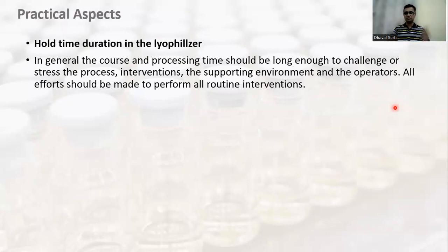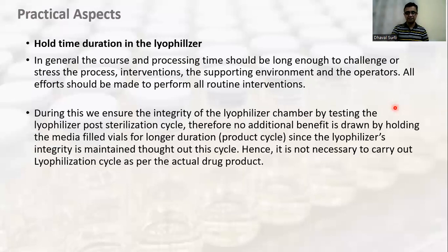So how long do we have to continue the lyophilized media? Long enough to simulate the process, all the interventions, to simulate the surrounding environment and the number of operators. And we have to perform all the routine interventions. This is a requirement. All routine, which are called inherent, and corrective interventions we have to do in the media fill. Otherwise, there is no surety that these interventions will not cause any microbial contamination in commercial production.